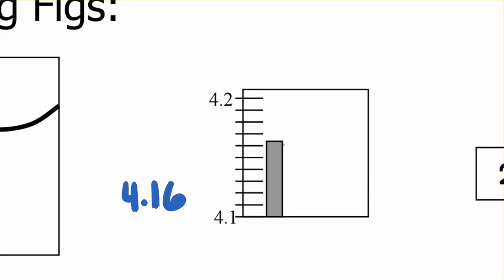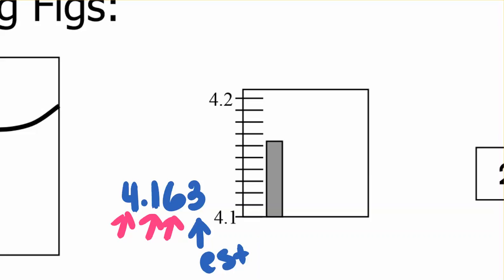So I'm going to say that next one is a 3. And again, this one's an estimate, so we may not see the same exact number there, but that's okay. We have to have one that's an estimate. Again, there are lines for these, but then we have one that's an estimate. Okay, so that's how many digits we write down.